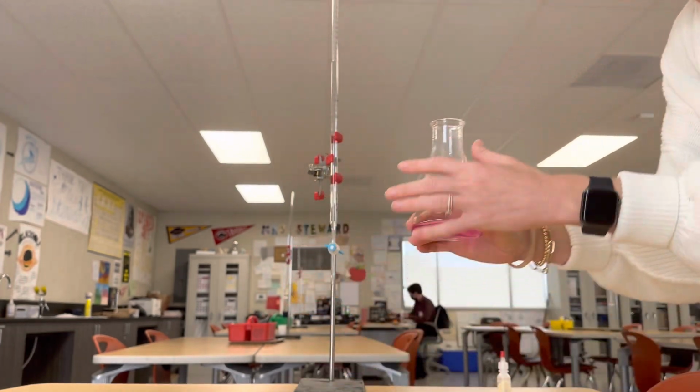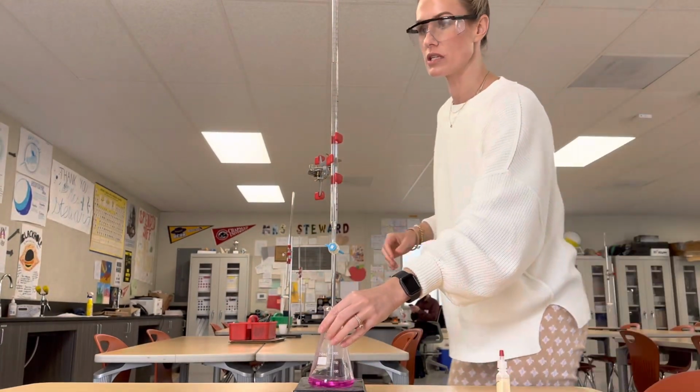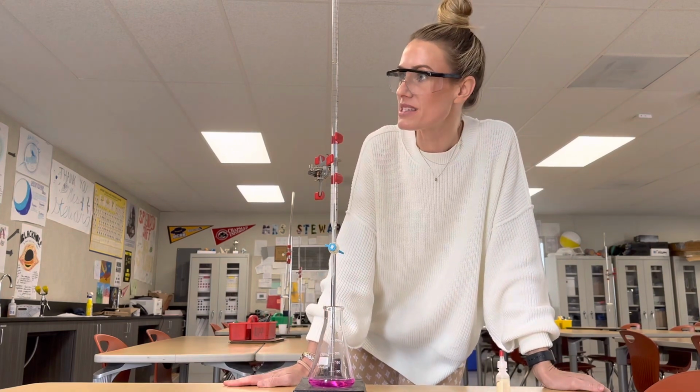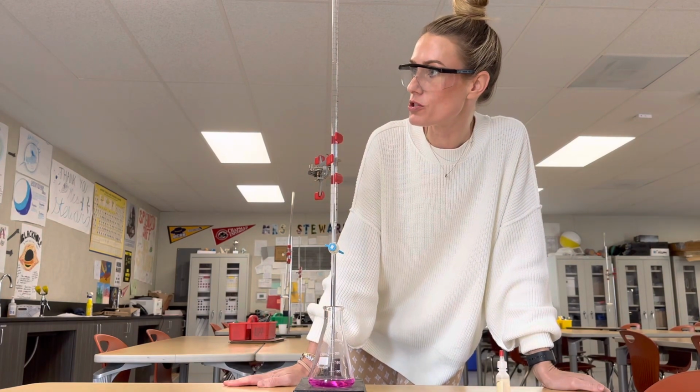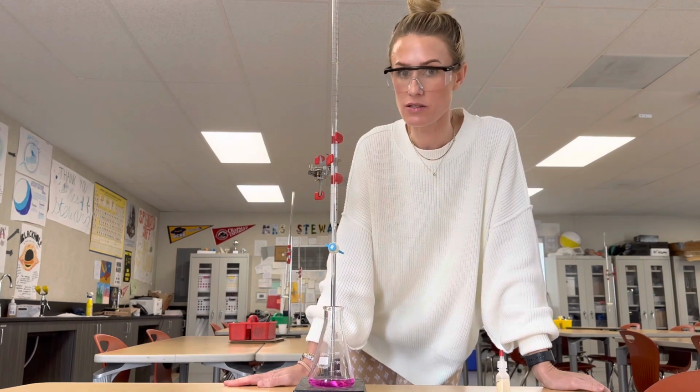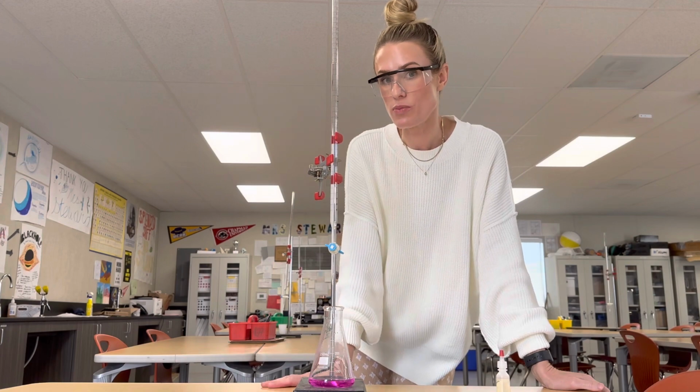And so we now want to see how much base we actually used. So my ending volume of my base looks to be about 22.7 milliliters. So your ending volume is 22.7.